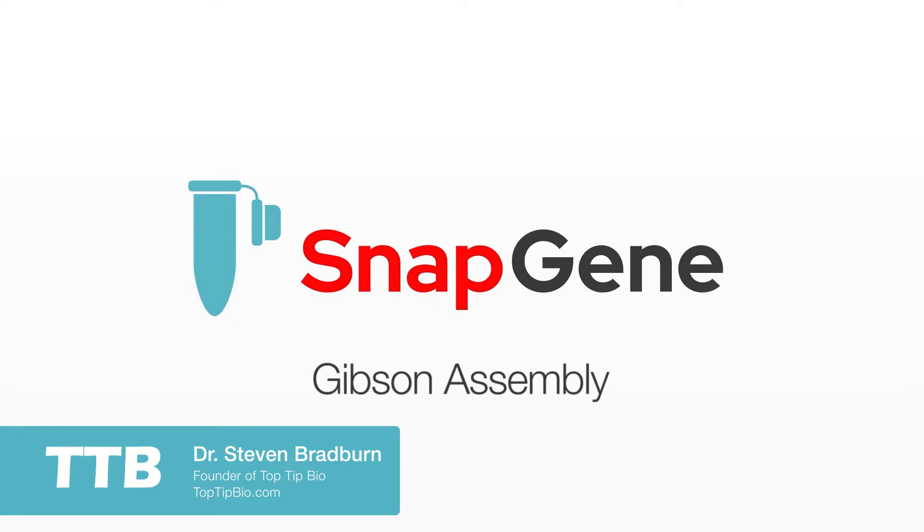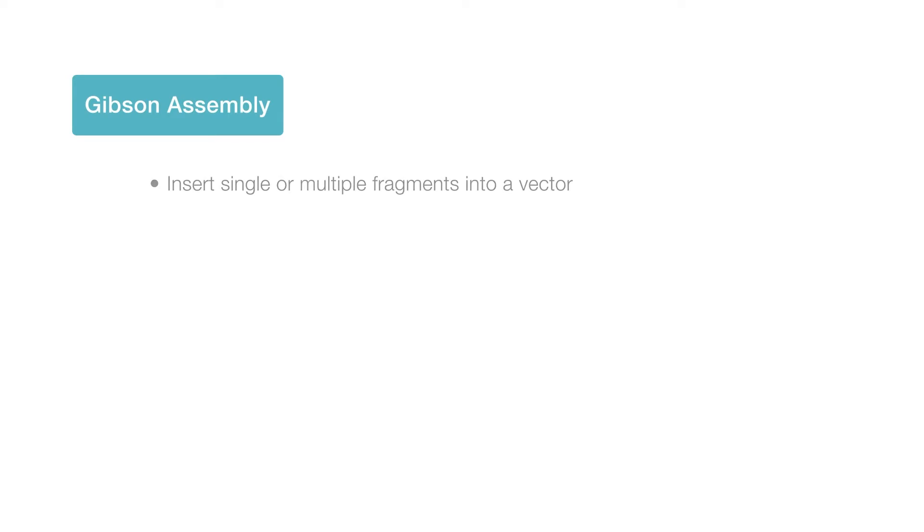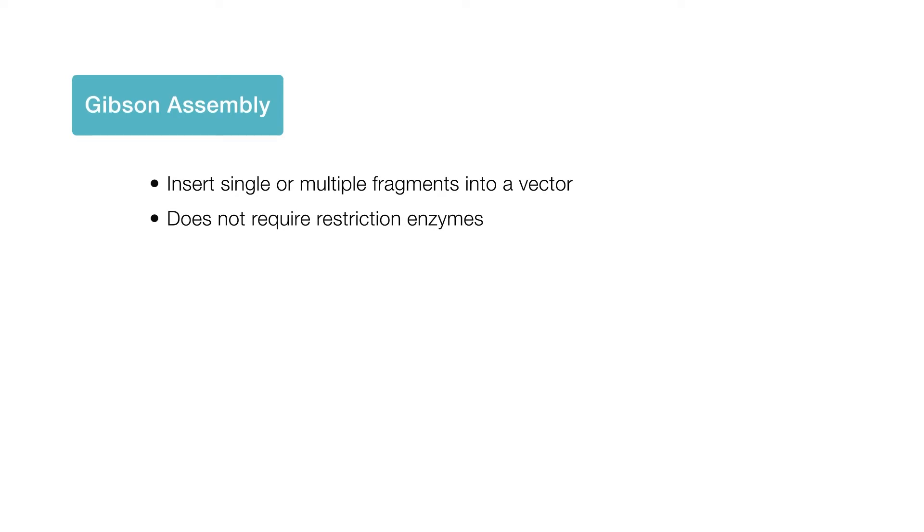In this video I will show you how to use SnapGene to simulate a simple Gibson Assembly cloning experiment. Gibson Assembly is a popular cloning technique used to insert a single fragment or multiple fragments into a vector without the need to use restriction enzymes. In this tutorial I will simulate a simple experiment where a single fragment is inserted into a vector using Gibson Assembly.